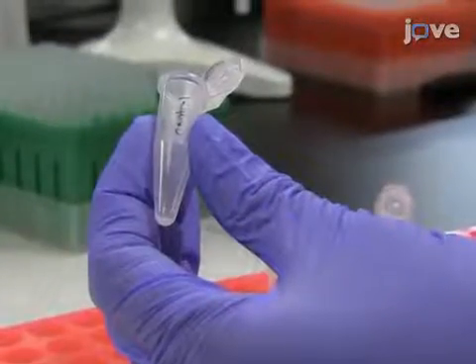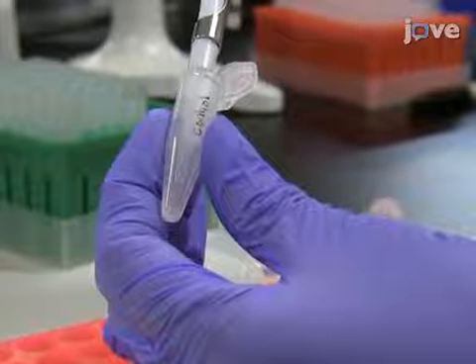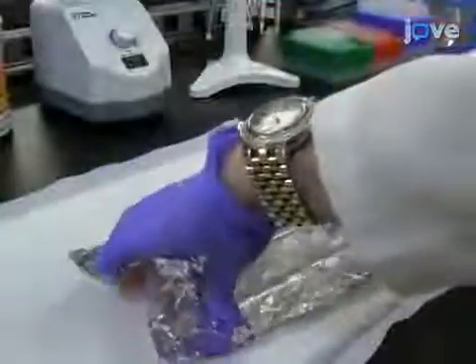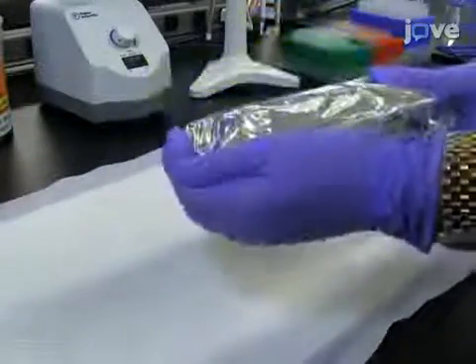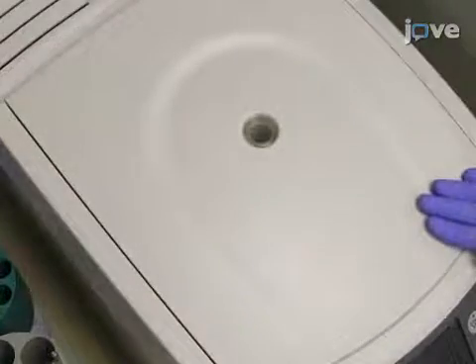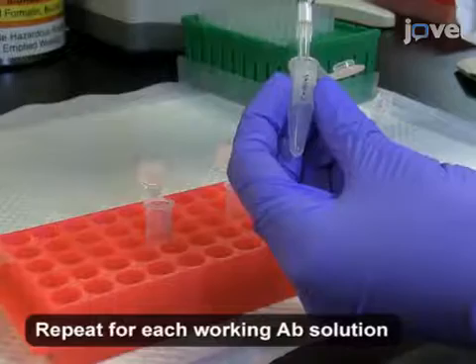Re-suspend the pellets in 100 µL of the first antibody of interest in permeabilization buffer for a 30-minute incubation in the dark at room temperature, protected from the light. Wash the labeled and permeabilized cells in 1 mL of fresh permeabilization buffer, and label them with the next antibody of interest as just demonstrated.